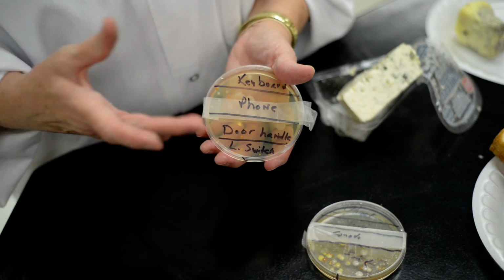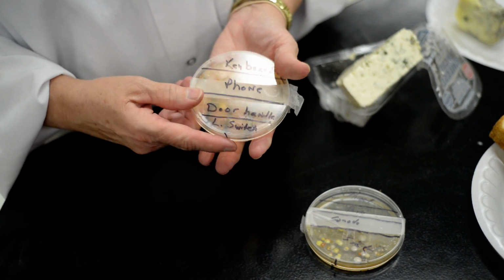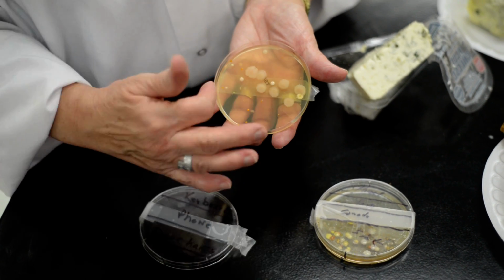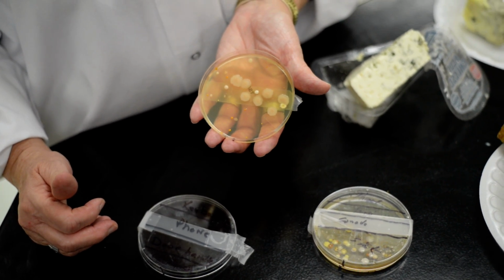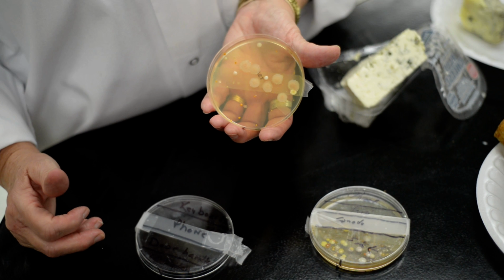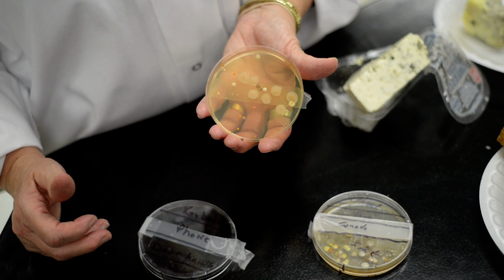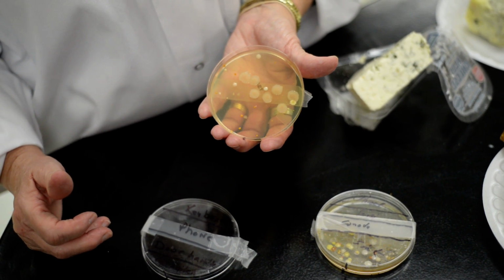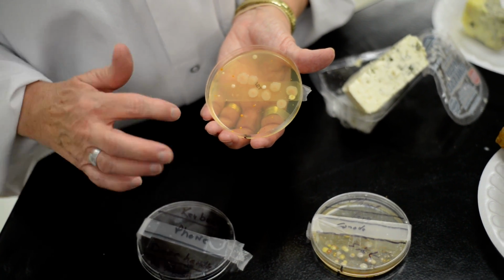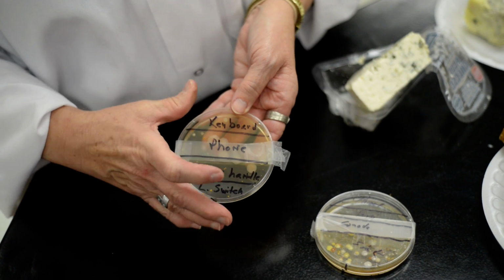Okay, so on those, and if you'll remember from chemistry class how to do this, I streaked off what I was doing. I took a Q-tip, ran it on whatever product I was going to use, very carefully ran it across the agar. It did take a little while to grow the examples that I have here. The one that did the most, which was sort of disgusting to me, was my phone. So you can see why germs are spread in different things. You can see little pieces down here that are different colors showing different kinds of bacteria. You can see a little bit of orange, a little bit of white, a little bit of tan, so a variety of different things. But make sure you label it.